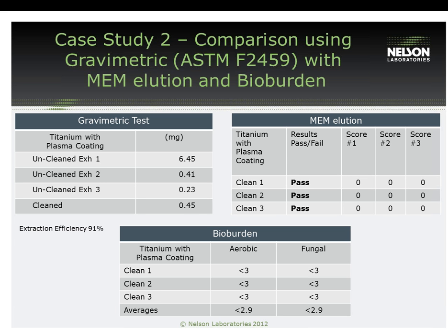Say if they tested at least 3 cleans and got around that 0.45 residue, you could show reproducibility with the results. You could see that having multiple samples tested here can make that look even better. Is that 0.45 milligram a fluke, or is that reproducible with the cleaning process?